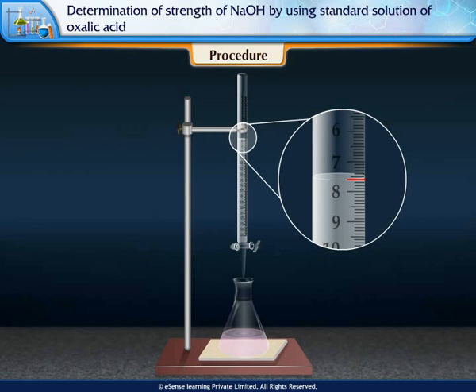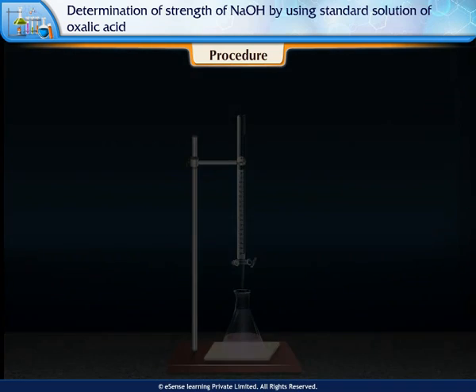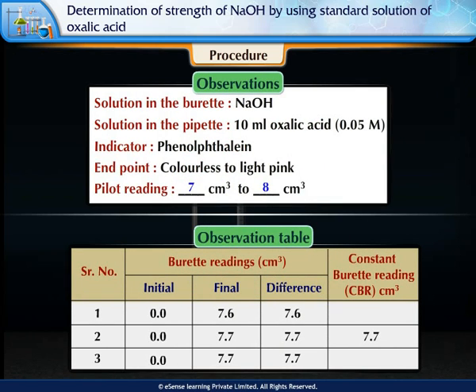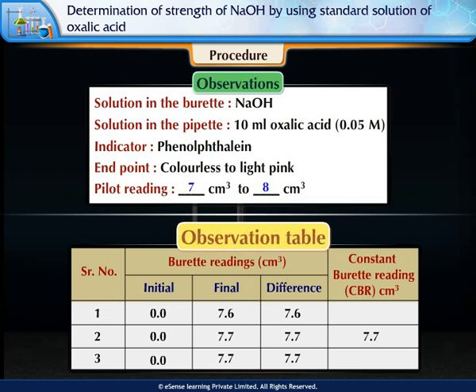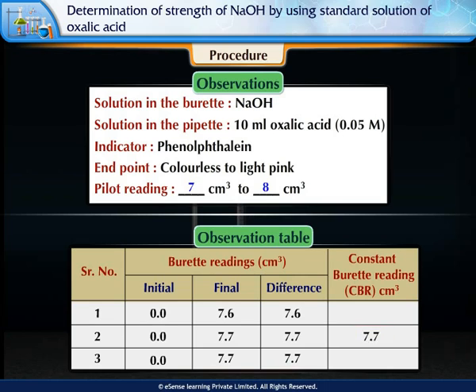Note the final reading in your observation table. Repeat the titration at least twice to obtain a constant burette reading. The constant burette reading obtained is 7.7 cm³.